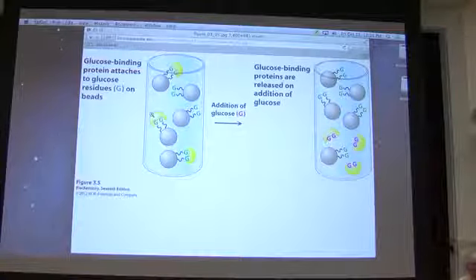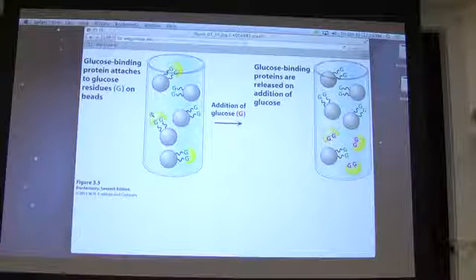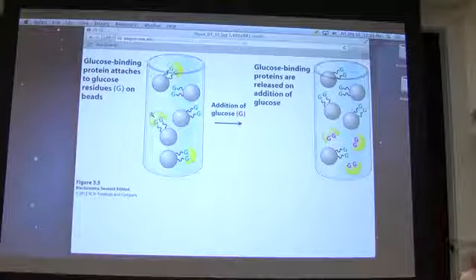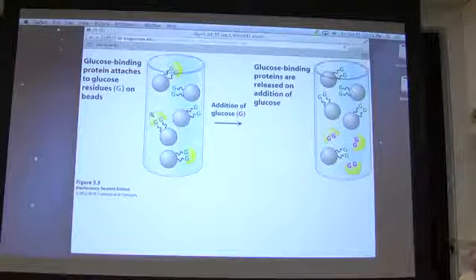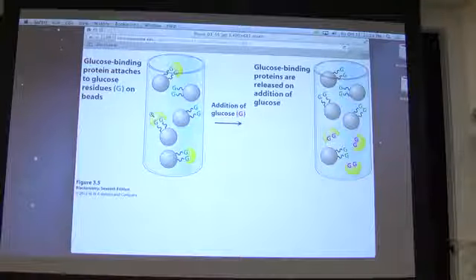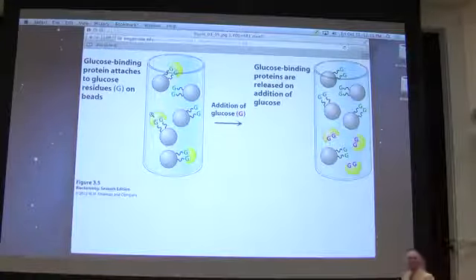Yes? To wash off the same molecules that you were using before, the DEAE and the other one? Okay, her question is, that's actually a very good question. Her question is, could I use the supports that are stuck on the column? Kind of like I did with the ATP, right? And the answer is you could. Generally, you wouldn't do that because A, they would be expensive, and B, they might contaminate your protein in a way that you didn't want to have them on there. But it's a very good question. Salt would be much less expensive, and we could always get rid of salt by dialysis. Make sense? Okay, good. Good question.